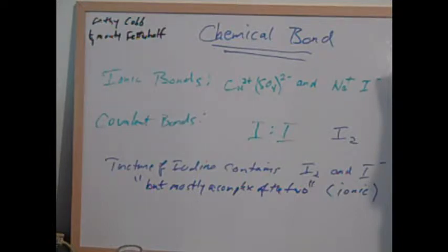And what this demo is all about is that like dissolves like. Polar solvents like water, which is ionic or polar, dissolve ionic substances like copper sulfate.